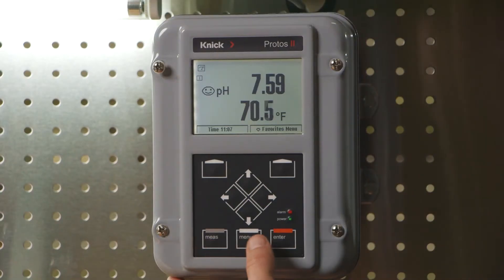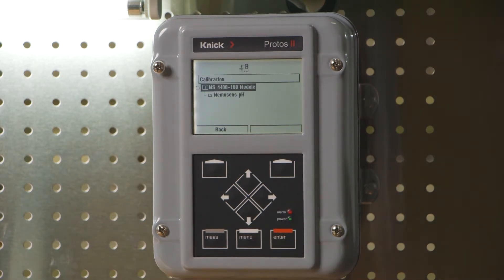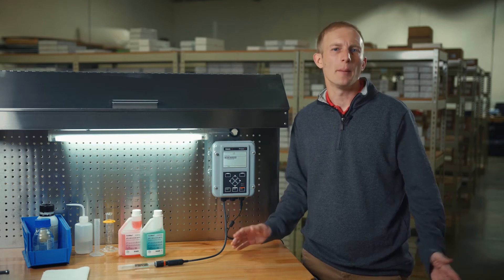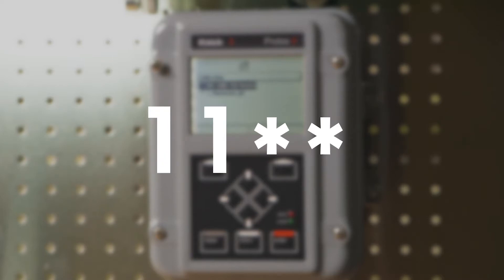Let's begin by pressing menu on the main screen and then enter on the calibration menu. If access to the calibration menu is blocked via a passcode, please note that the default passcode is 1147.